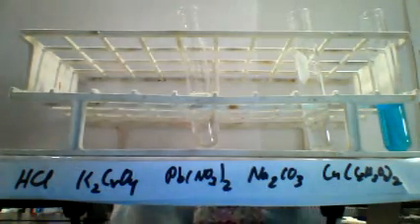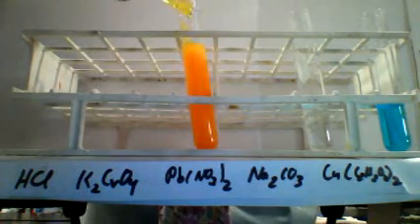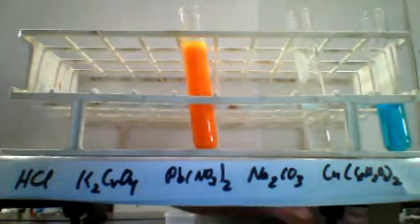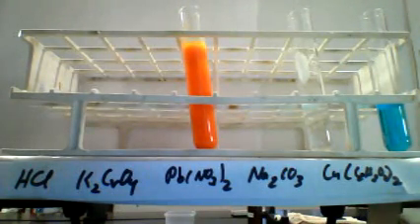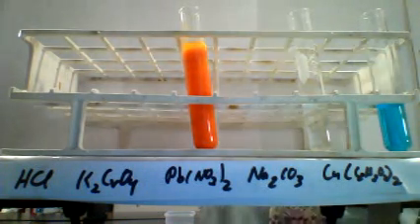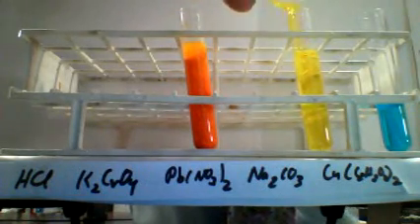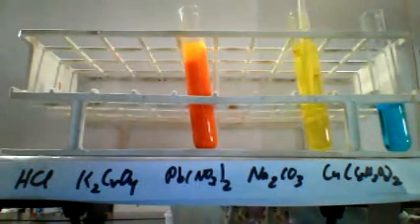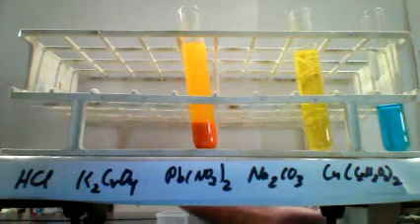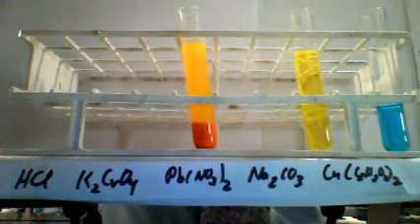Pour them together, mix, and see what happens. Stir them together and observe the results. So we mix the solutions together and see what happens.